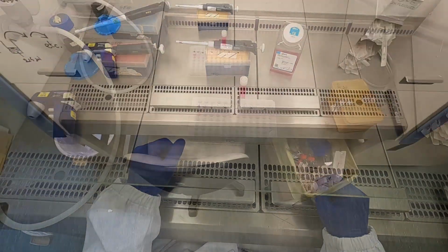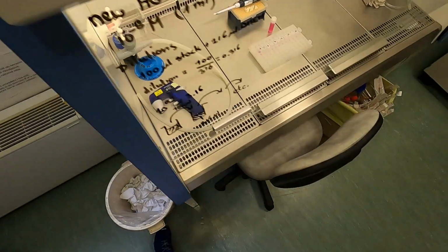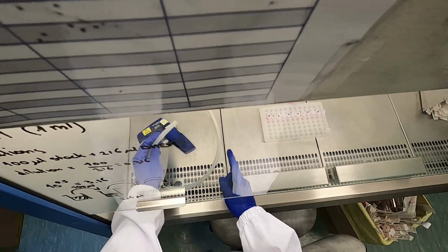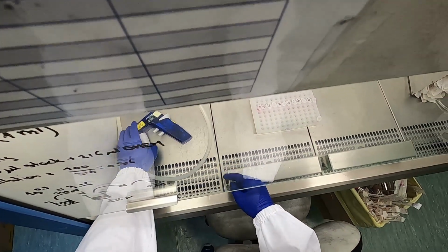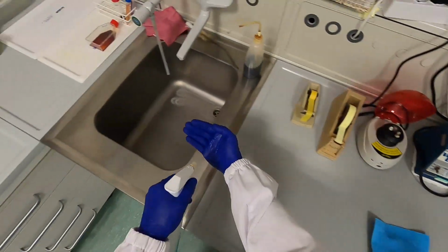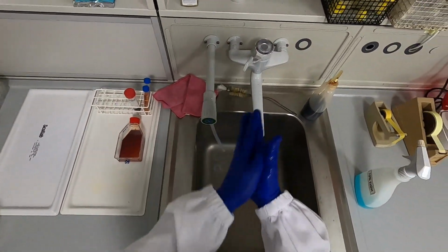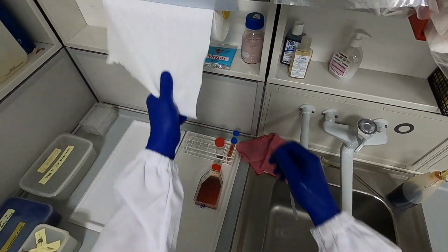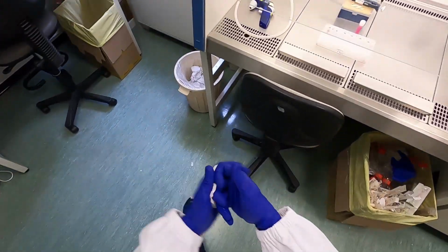Okay, we're going to replace the medium that's on the cell, so we have to switch on the vacuum and of course check as well, just for fun. That works. Okay, go and get the cells. You can indeed put a little bit more ethanol on your gloves, just have it extra clean. And let's go to the incubator to retrieve the plate.